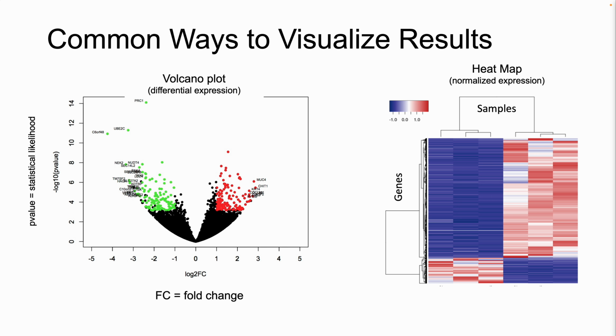The last thing in the Colab notebook are going to be 2 plots like this. Volcano plot, which the x-axis is the fold change, and the y-axis is the p-value, or negative log p in this case, just so it scales where more significant is higher. Oftentimes when you do differential expression analysis, you're interested not only in the statistical significance, but the fold change. Because I talked before about how fold change of 2 might not be statistically significant.